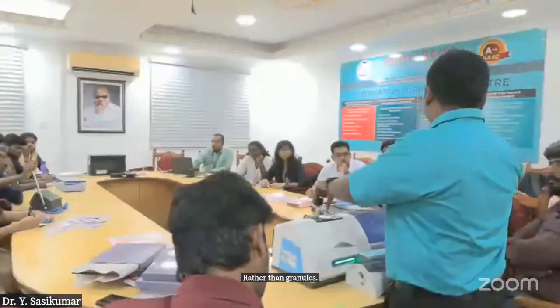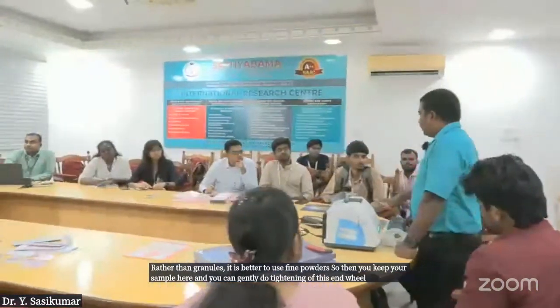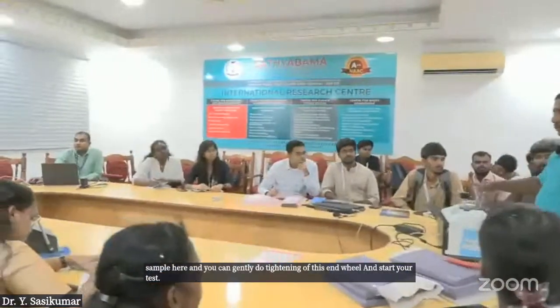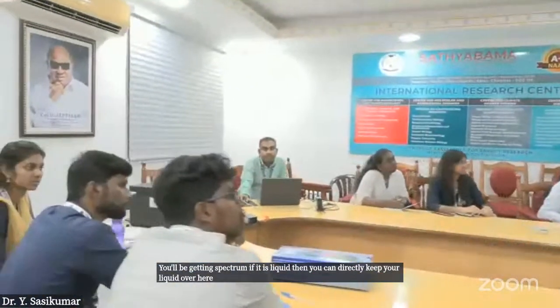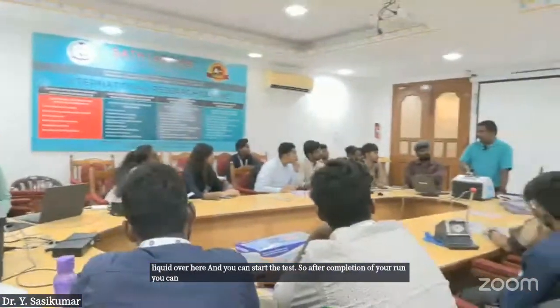You keep your sample here, gently tighten the anvil and start your test. You'll get the spectrum. If it is a liquid, you can directly keep your liquid over here and start the test. After completion of your run, you can wipe it out.